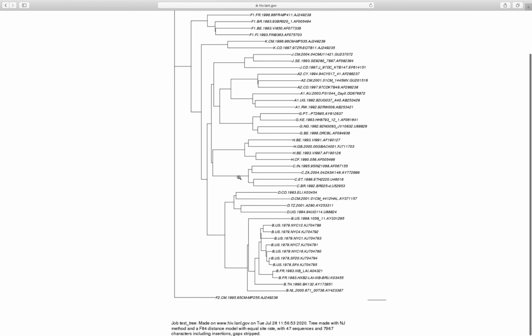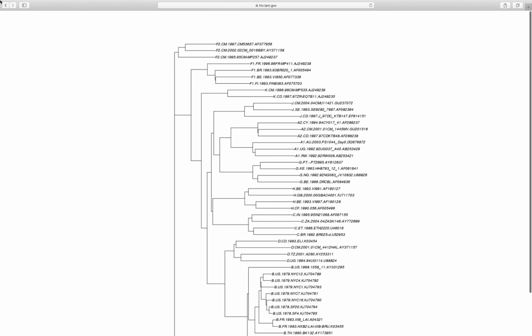And then what you can do also is look at smaller parts of the virus from different areas and in different conditions, and you can do these types of analyses to see, in general, at a zoomed out level, are there maybe relationships between sequences or sequence homology between several different classes of viruses, and then that allows you to think about ways in which those homologies may have occurred. So there may be functional reasons why there's homology, or there may be evolutionary reasons for that homology. So this is pretty cool.